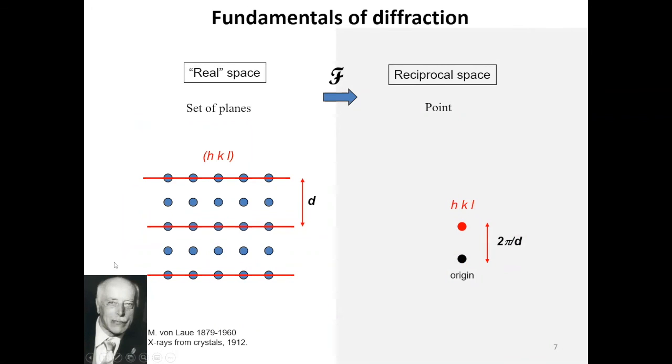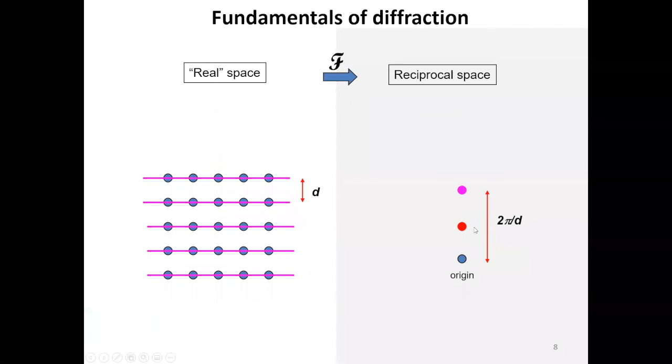What this corresponds to in reciprocal space is a certain spot. If you use a different set of planes, of course, you'll get a different spot in the reciprocal space. As you start looking at information in different planes for the atoms in the crystal, you get different spots in the space. If you use planes in a different orientation, you get a reciprocal space spot there.